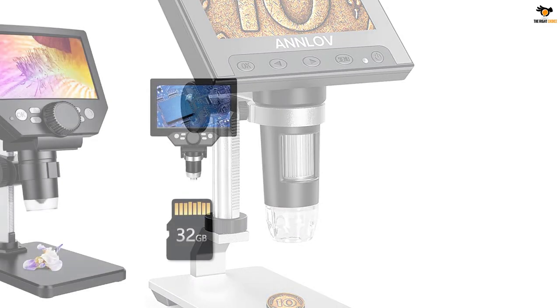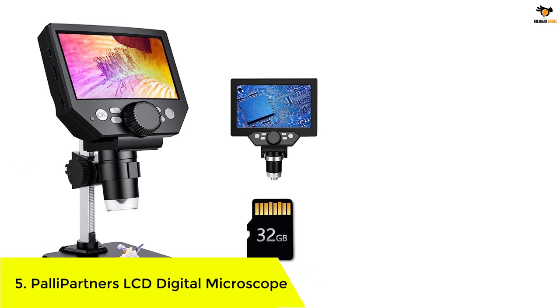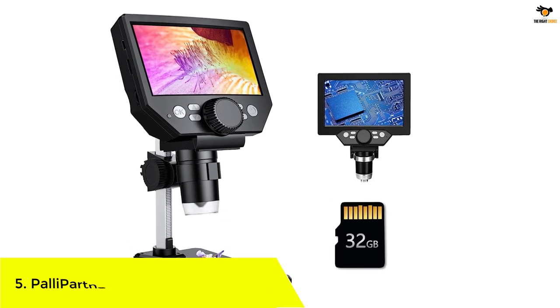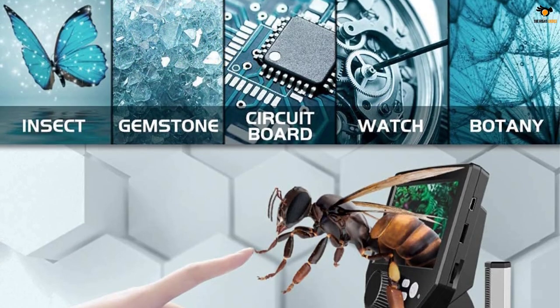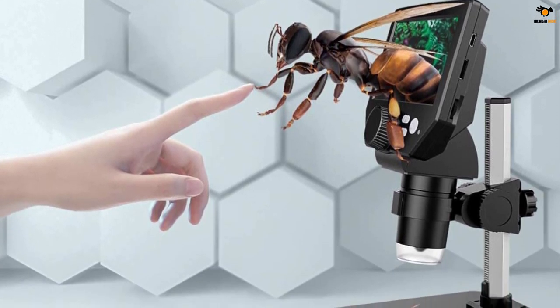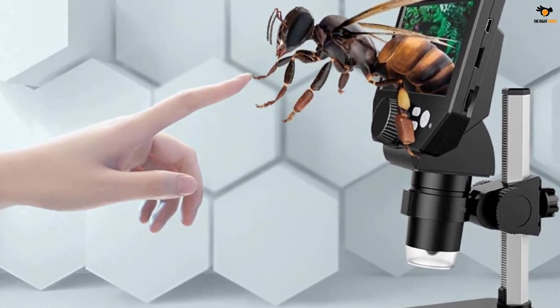Okay, let's dive into the video. Number 5: Pali Partners LCD Digital Microscope. The Pali Partners LCD Digital Microscope is super cool for checking out tiny things. It has a 4.3-inch screen and a 10-megapixel camera that shows clear and detailed views of the tiniest things. I can see things up close and clear with the microscope's adjustable magnification of 500-1000x.